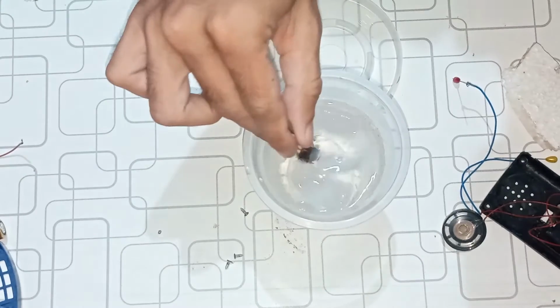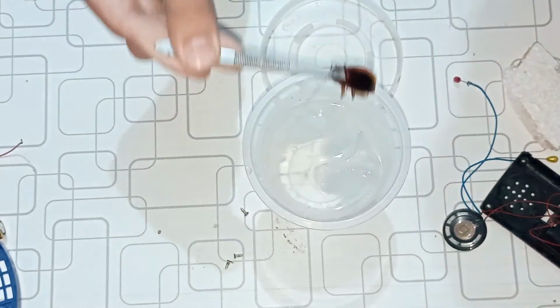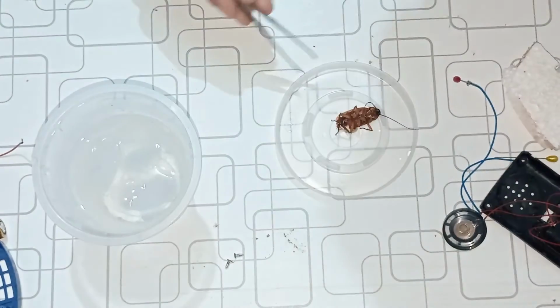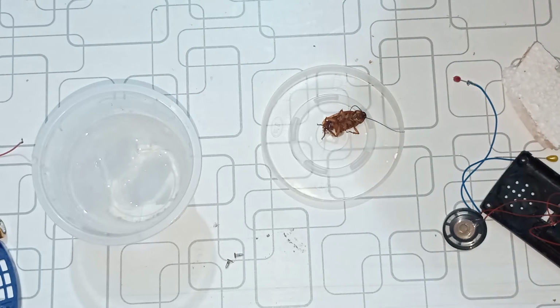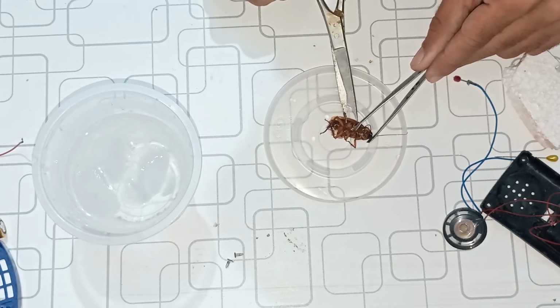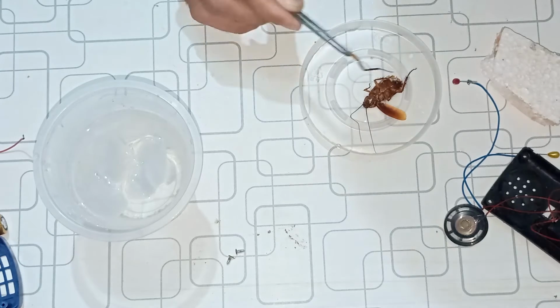So I am taking this cockroach out. This is our cockroach, as you can see. So let me cut out its leg. So here is its leg.